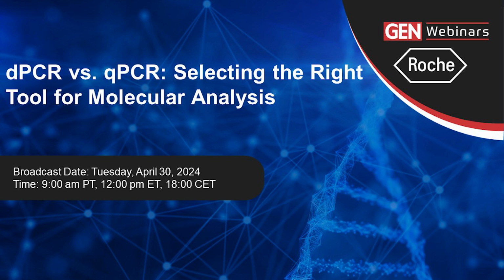Today's topic is dPCR versus qPCR, selecting the right tool for molecular analysis.